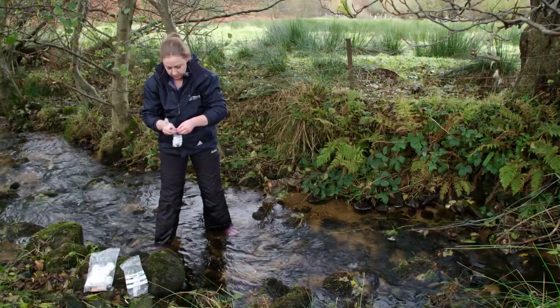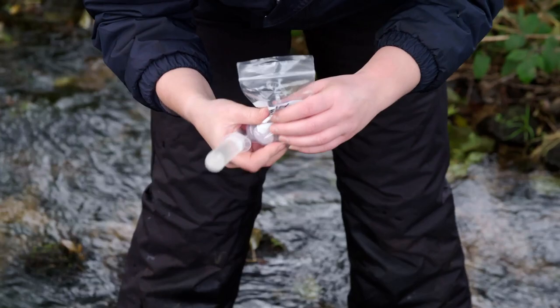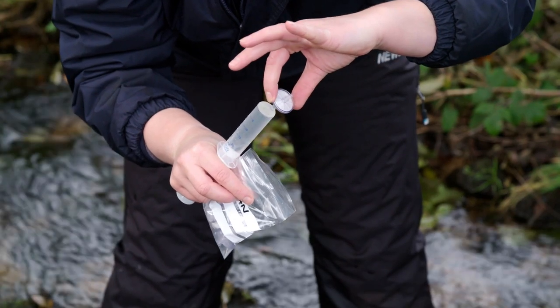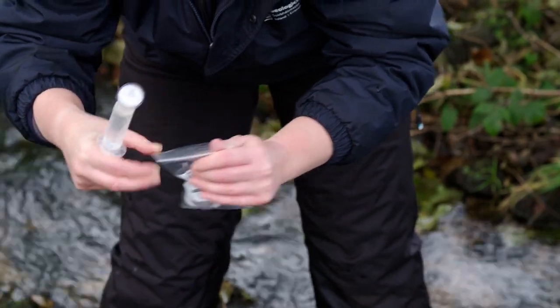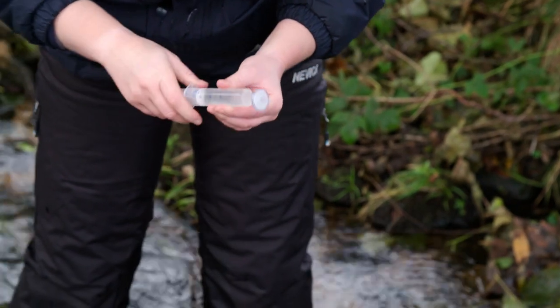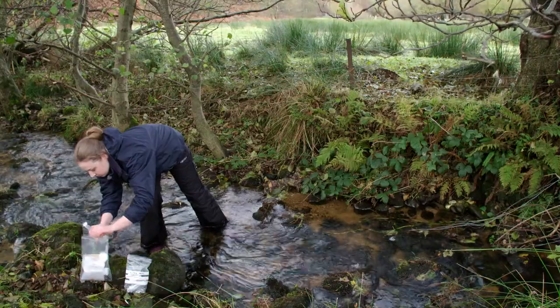Remove a filter from the small polybag containing clean and unused filters. Handle it only on the edges and take care not to touch the tip or allow the filter to become contaminated. Carefully place the filter onto the end of the syringe, then seal and return the small polybag to the larger bag containing the syringes. Press the syringe lightly to release a few drops of water and to equilibrate the pressure between the syringe and filter.